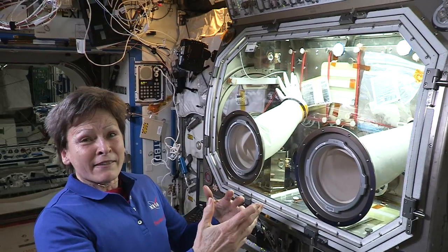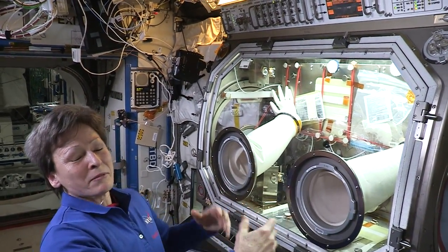Now I'm growing cells and they have to be grown in a sterile environment. So now I'm protecting the cells from me by having them inside this environment.